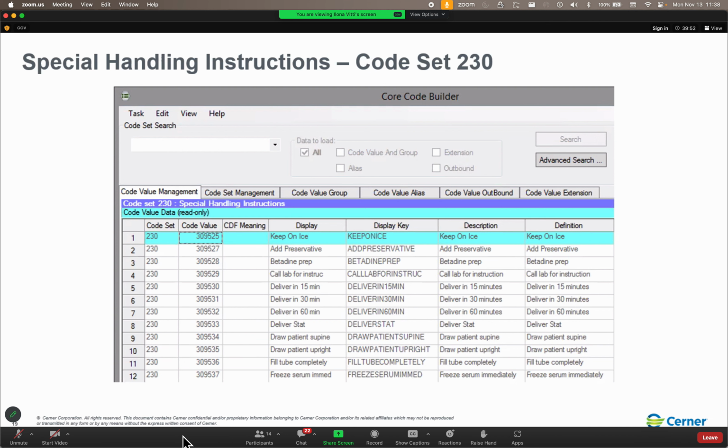So if you don't see that list of applications at your site in Bedrock, there is separate Bedrock Wizard security involved in that. So you'll need to ask whoever's managing your Bedrock, hey, can I get this? Because it is really nice to have. And Krista agrees with me.